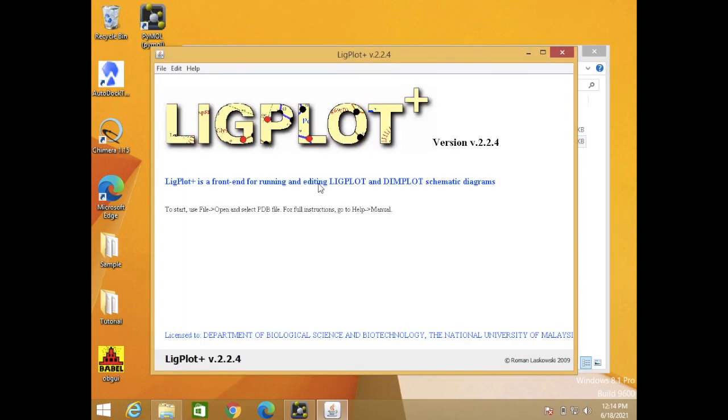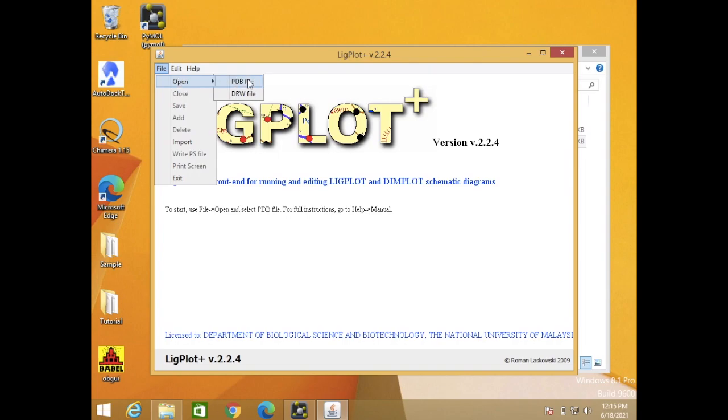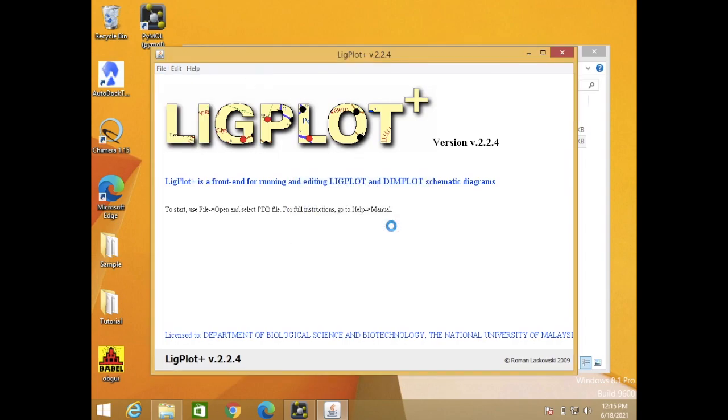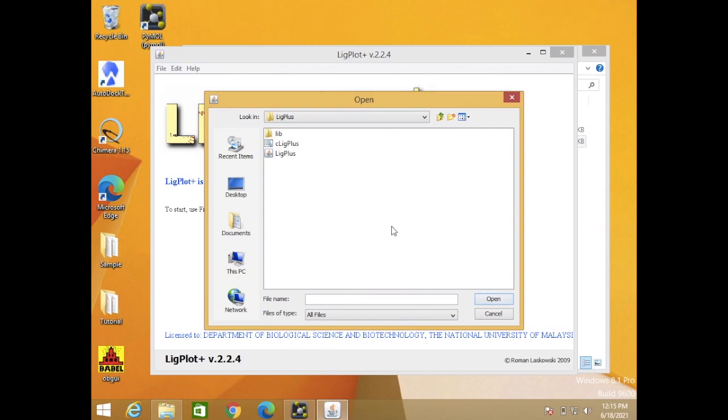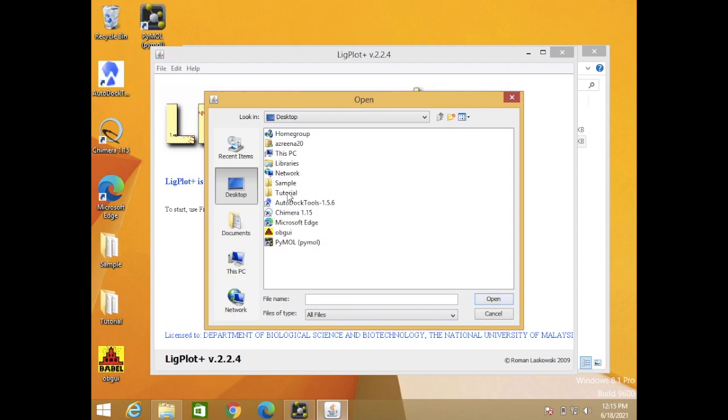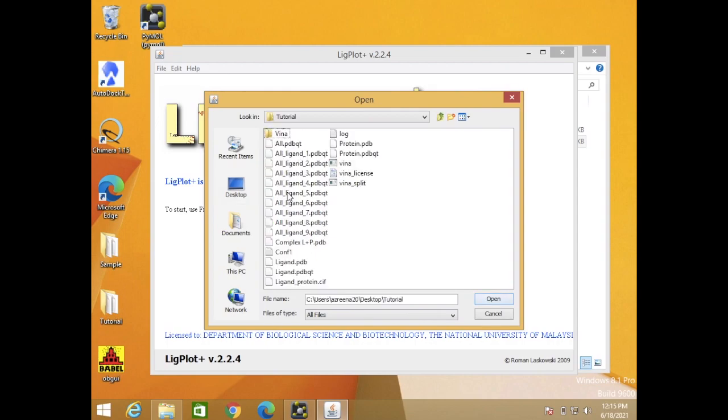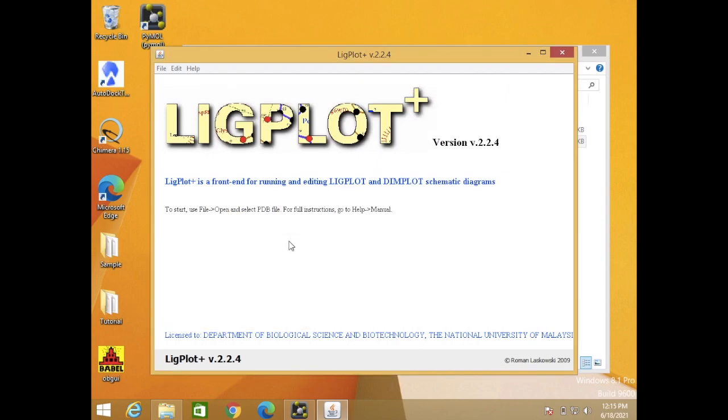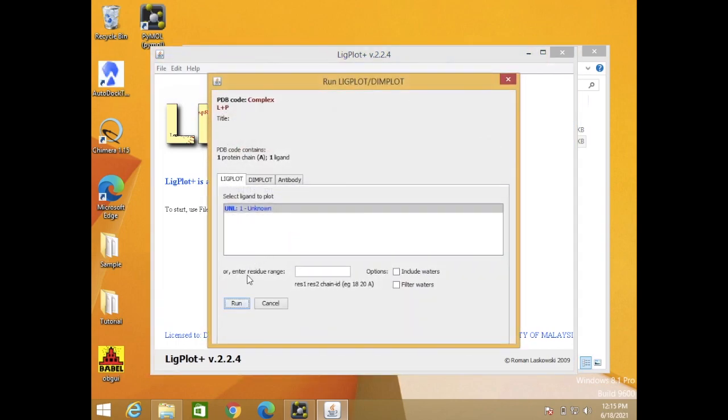To start, you just use the file and then open and select the PDB structure you want to visualize. So files, open, and PDB, browse. I want to browse from the desktop where my files are. So here, this is my file complex. This is specific for ligands and protein for Ligplot.